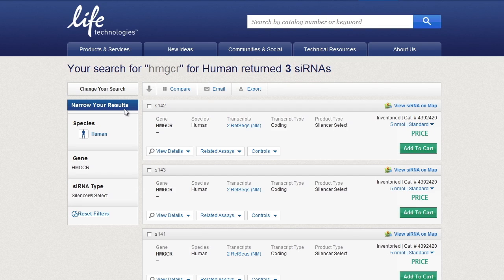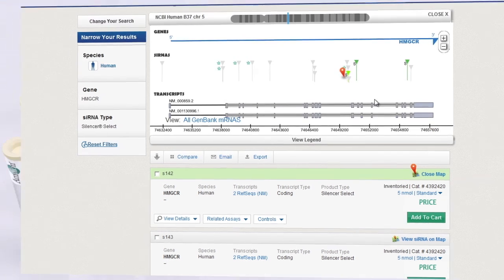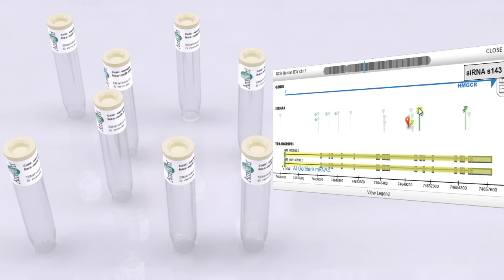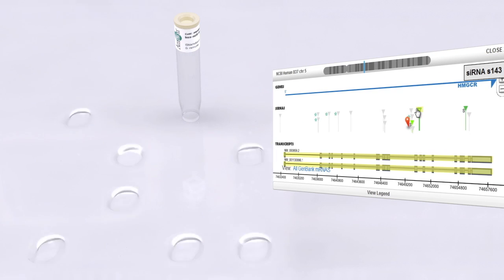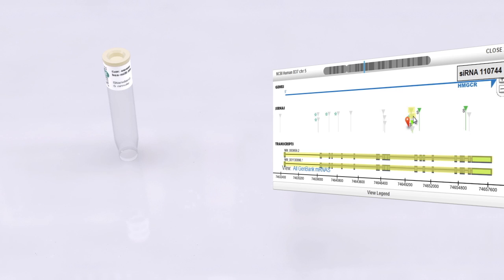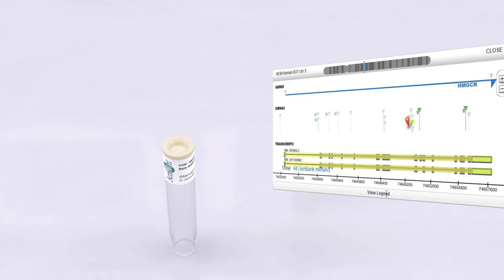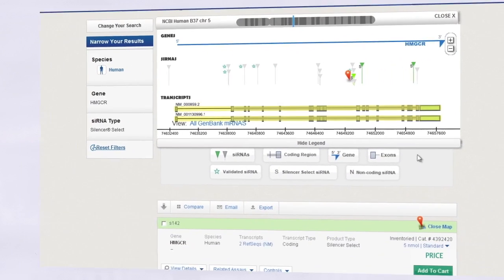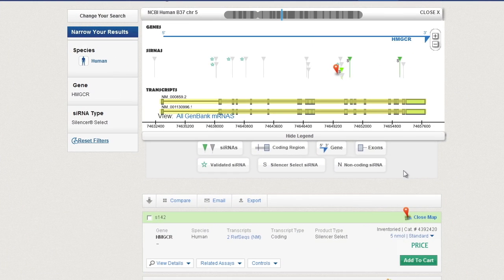Results appear instantly, and the genomic search tool lets you use handy filters to narrow down your search. A genome map shows your siRNA location in the mRNA transcript as well as the different transcript variants available. Use the handy legend to help you identify key points of interest.